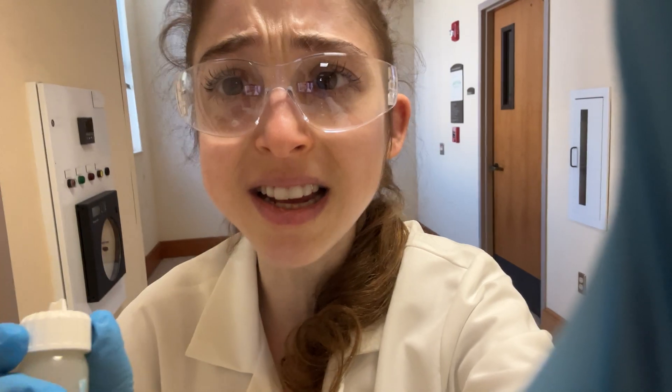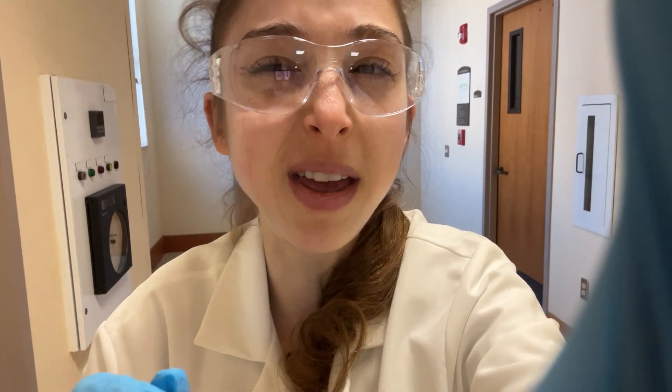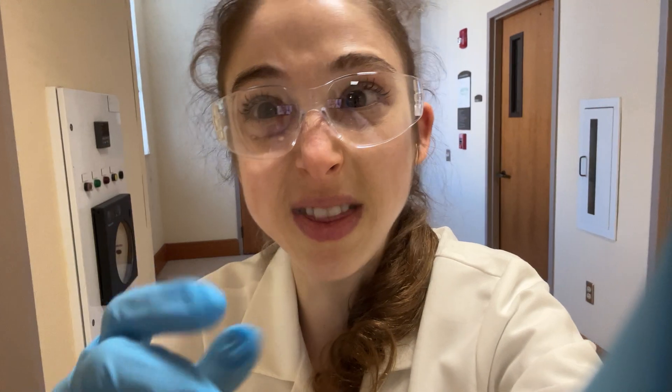Protease inhibitor is insanely expensive. So we only added the good broad-spectrum stuff for the lysis step, and then we added a cheaper thing - PMSF - for the later steps. PMSF is a pain but it'll inhibit most proteases, specifically serine proteases, not other kinds, which is why we want that broader-range one for the beginning lysis.